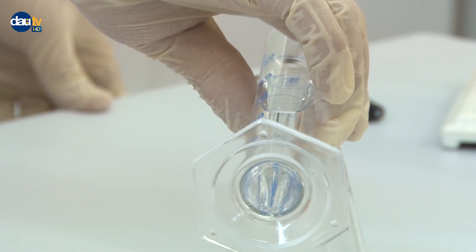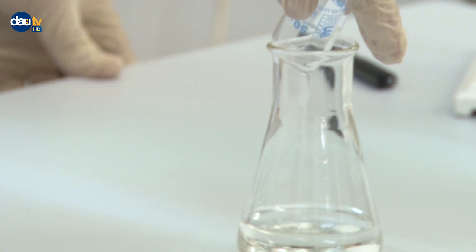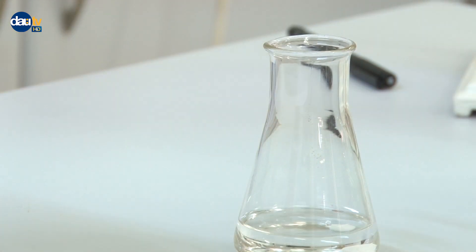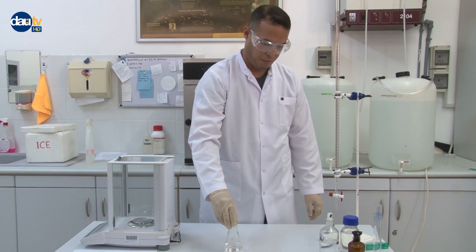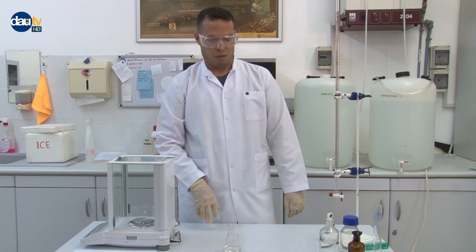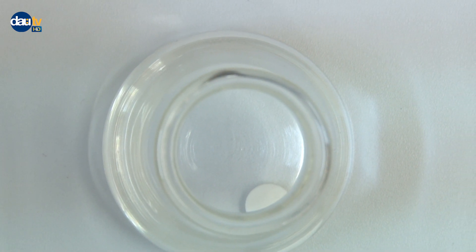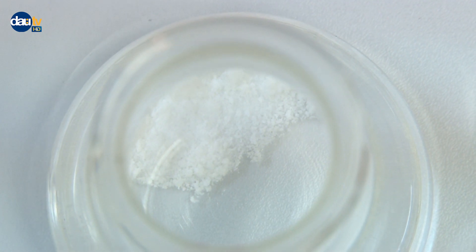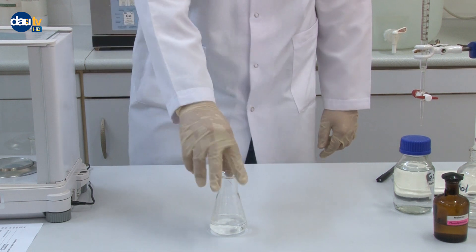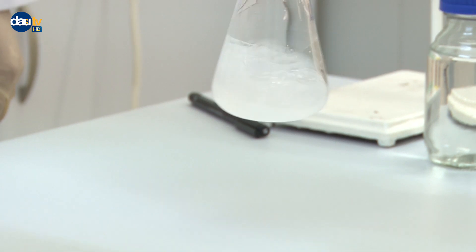Add the ethanol solution to the flask. Allow the tablets to stand for a few minutes until the complete disintegration of the solid into a cloudy solution after shaking.